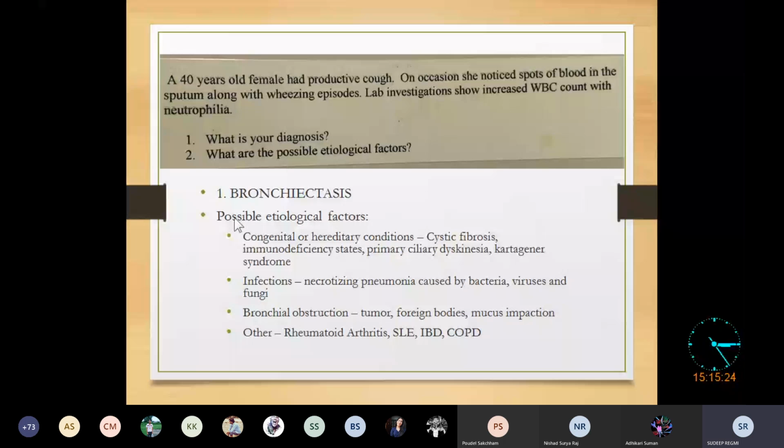Shall we go to the next gross? Yes, sir. Okay. Can anyone describe this?